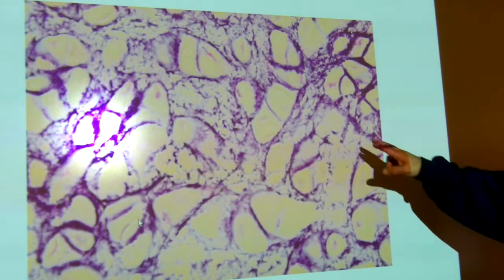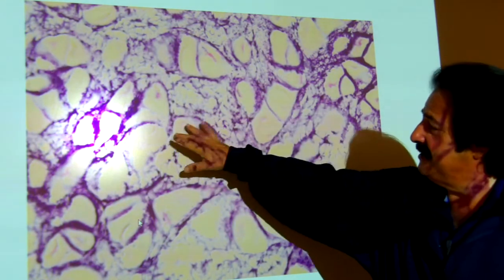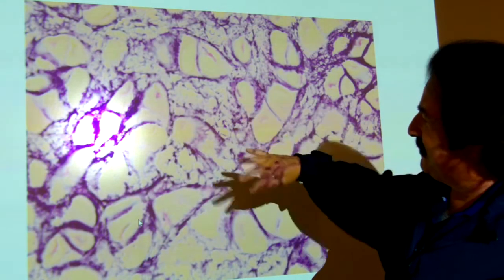And here is our elastic cartilage. At this view right here, notice that a lot of luminous space, all the threads really close together. So all this cartilage, because it has all these fluid-filled spaces here, allows this to bend.